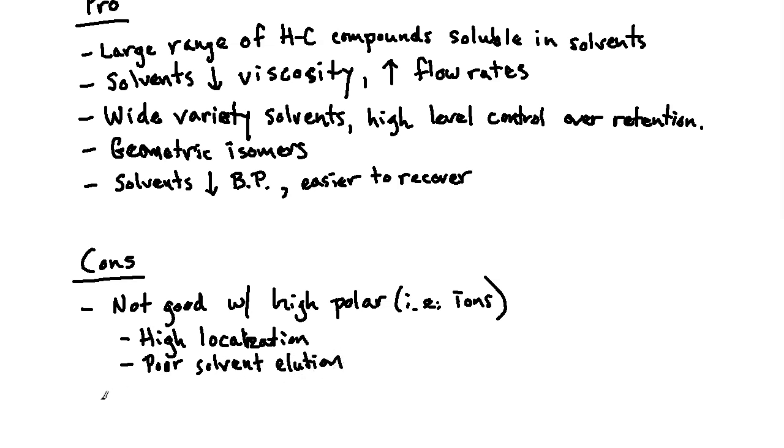One of the other things you've heard me mentioning as we've gone along is that water typically needs to be avoided. I'm going to put a star with this one. You need to be careful of this with the bare silica, because it can set up and almost make its own addition to the bare silica column with how strong the adherence can be. So water, generally speaking, needs to be avoided.